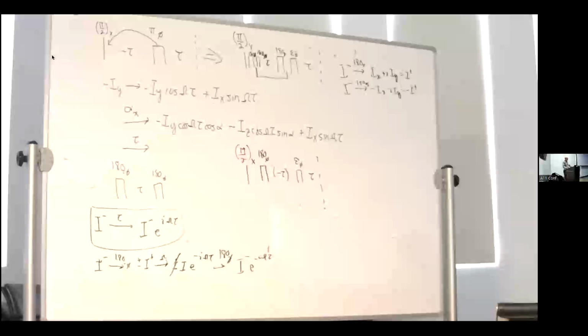Before gradients came in, most of the 180s in the pulse sequence had to be cycled by exorcycle in order to reduce artifacts. So if every 180 has to have a 4-step phase cycle, you would look in some homonuclear experiments, and the phase cycle might be 128 steps.